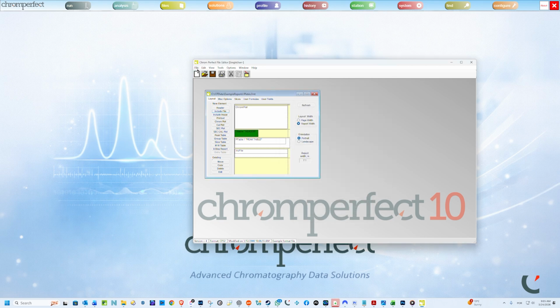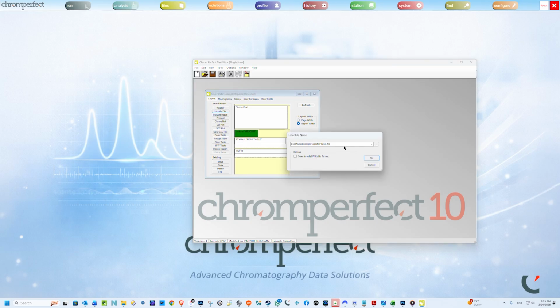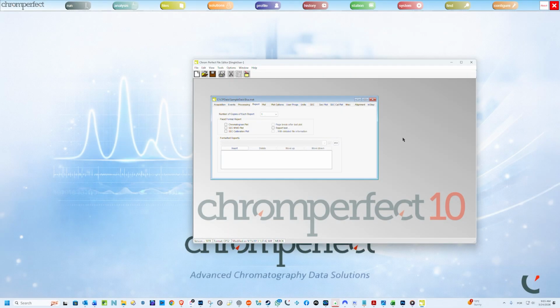As described earlier, a format file can be saved as an individual file, which exists independently. It can also be referenced from a method file. This is done in the Method File Editor under the Report tab. At this stage, it is important to keep the focus on structure and understanding, rather than building complex reports.